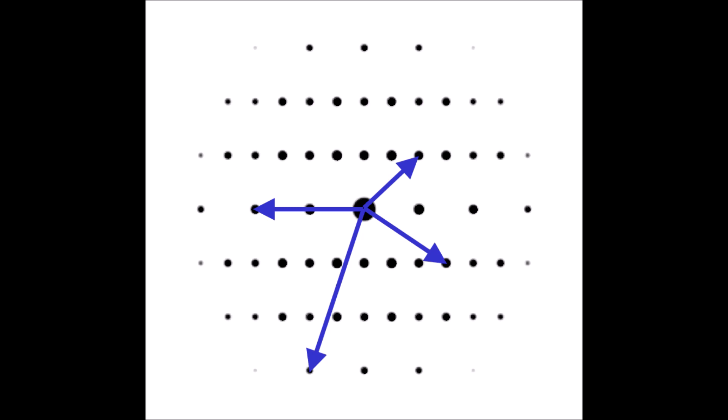And each of these G vectors is actually normal to the specific set of crystallographic planes that corresponds to each spot in the diffraction pattern.